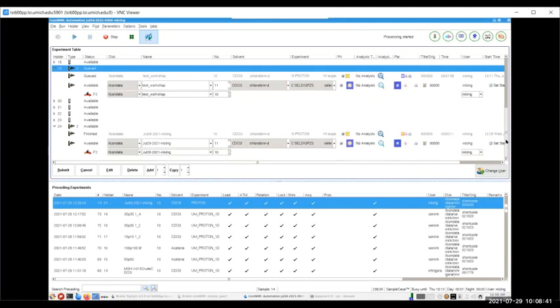As an example here, before the workshop, I ran a 1D selective NMR experiment. I set it up the way I just showed you, and it was run and finished. So now this 1D proton experiment on my sample is finished. But the 1D TOCSY experiment has not started yet because it's waiting for me to define the region that I'm interested in. So I will go to the proton experiment which I just ran.